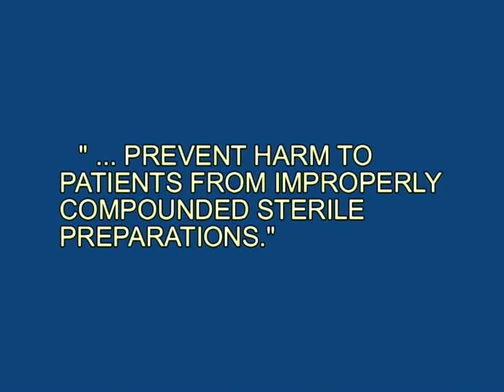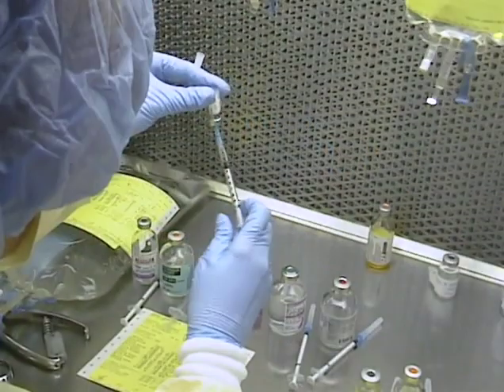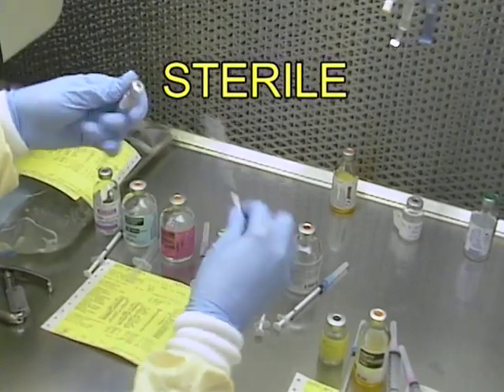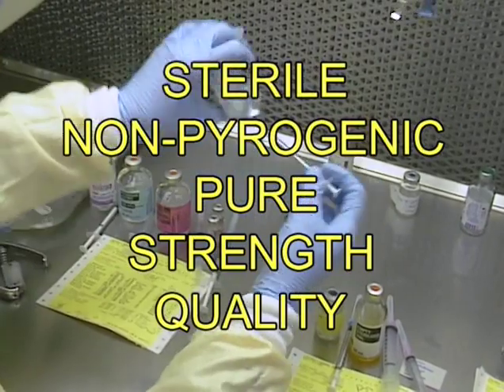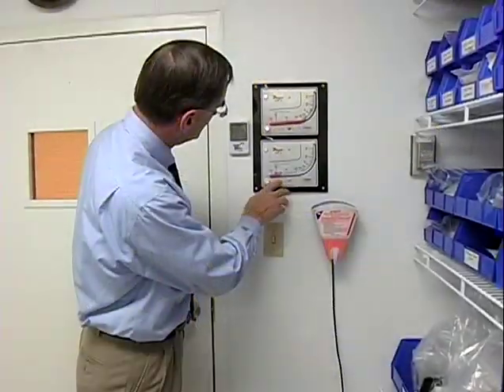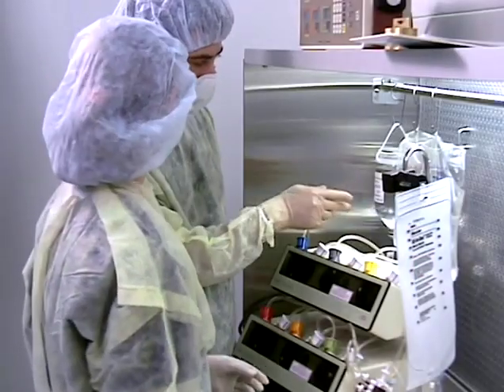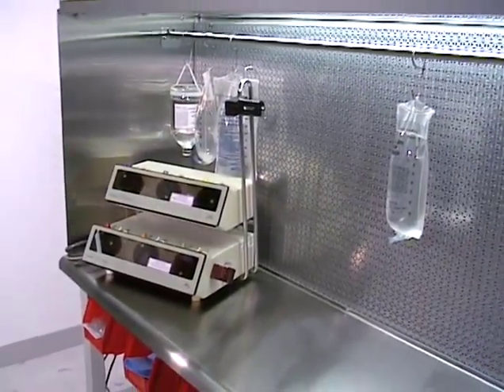USP 797 was instituted to prevent harm to patients from improperly compounded sterile preparations, identified in recent years as a major source of patient morbidity and mortality. It is an evolving standard that defines the conditions and practices that are required to consistently compound preparations that are sterile, non-pyrogenic, pure, and of the intended strength and quality. USP 797 establishes enforceable standards for facilities, personnel training, knowledge and practices, and equipment in every location where compounding is carried out.